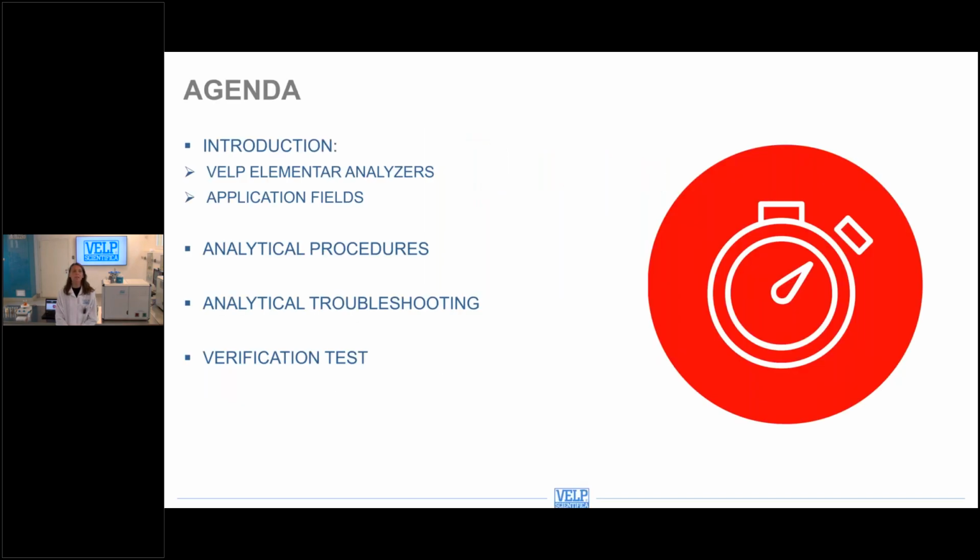Just two words about the agenda of today's training. We will have a brief introduction about Velp NDA Duma analyzers and their application fields. And then we will see the analytical procedures. Then I will leave the word to my colleague Matteo Bassani, who is here today with me, and will be the main presenter of this training, about the analytical troubleshooting.